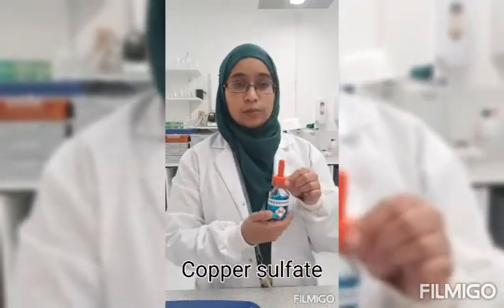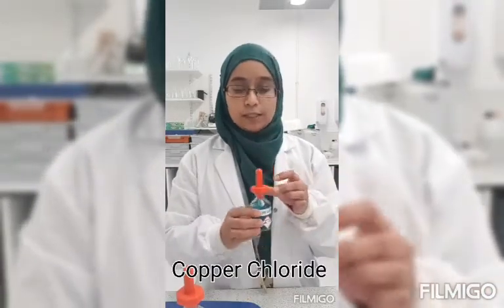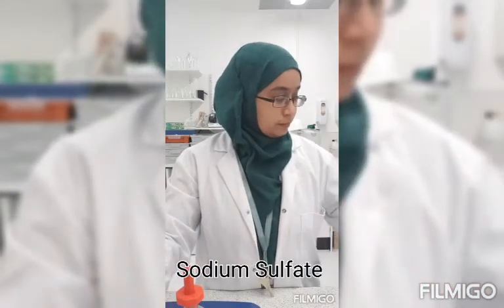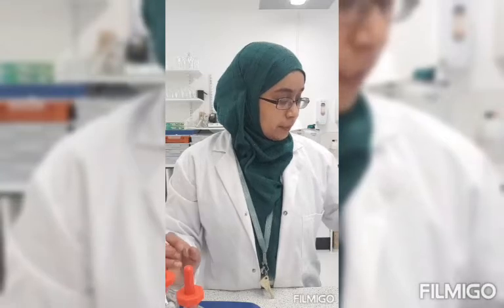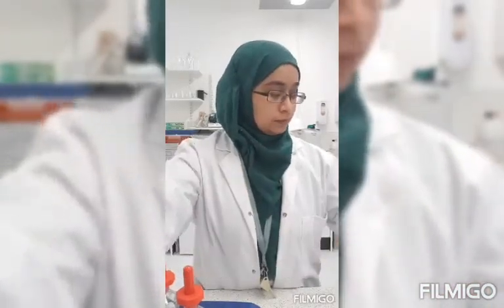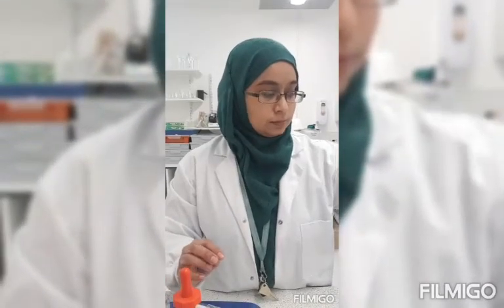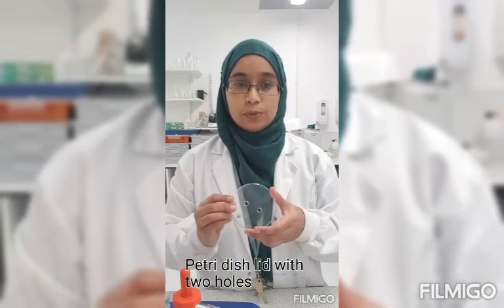solution of copper sulfate, solution of copper chloride, solution of sodium sulfate, and solution of sodium chloride. You'll also need some leads and some crocodile clips, some blue litmus paper, a beaker, 2 carbon graphite electrodes, a petri dish lid with 2 holes on it.